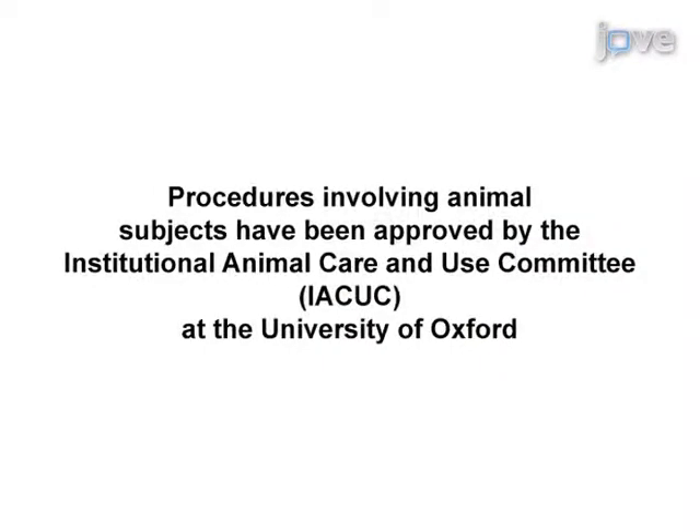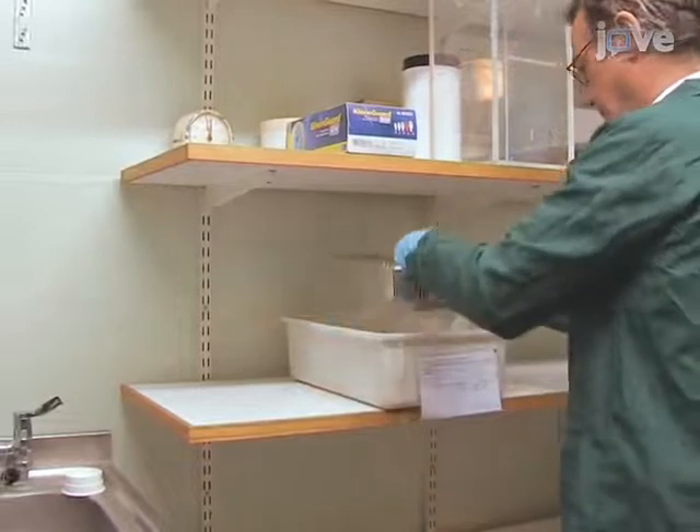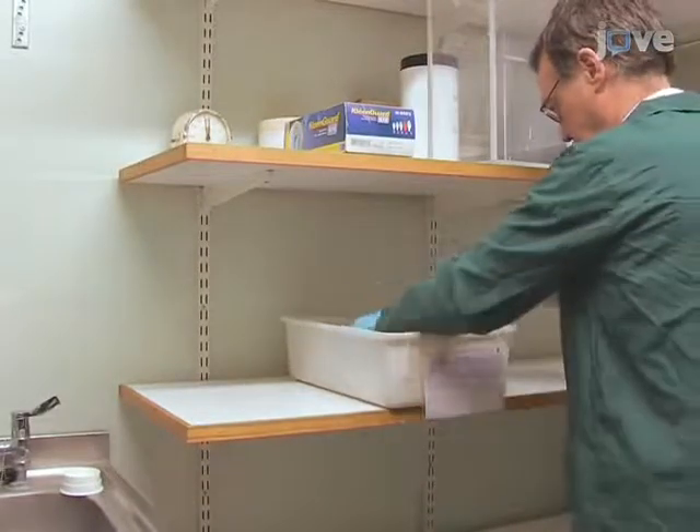Generally, individuals new to this technique will struggle because of the difficulty of correctly placing the mouse on the apparatus. For all of the following tests, bring the mice to the experimental room 5 to 20 minutes before testing to ensure they are fully awake.